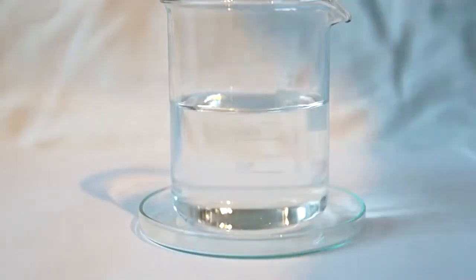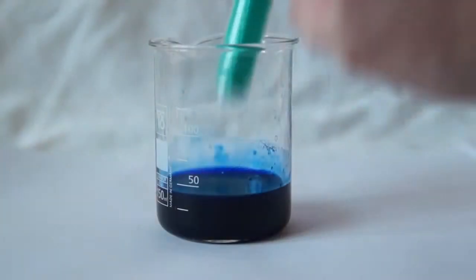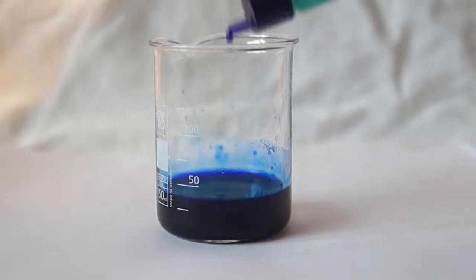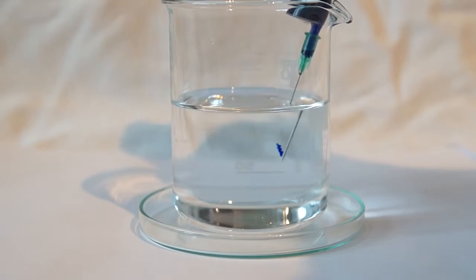To obtain the artificial silk, prepare a dilute solution of sulfuric acid. Next we fill the syringe with a few milliliters of viscose. Fit the needle and slowly inject a stream of viscose into the acid solution.